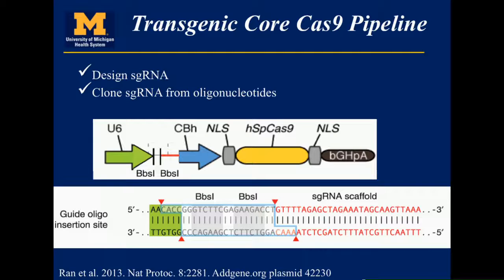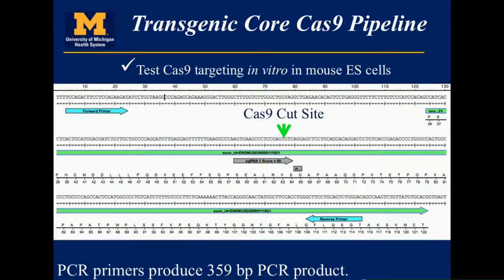So that is one of the reasons we do the zygote microinjection, because if the lab drops off the CRISPRs, we microinject it, there's no pups born. We want to know that the reason is not toxicity at the zygote stage.